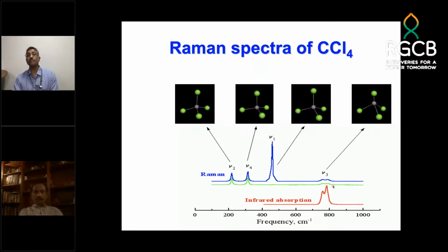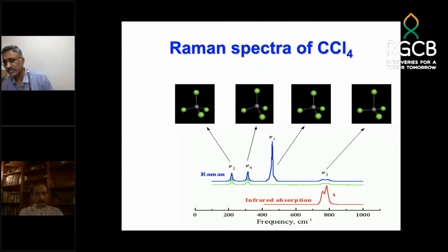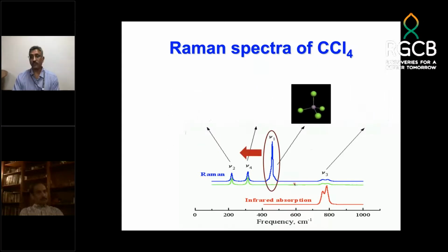In fact, many of you would have seen that Raman can even be used in a complicated molecule like DNA. So DNA fingerprinting can be done using Raman because of this reason, that they have very unique characteristics even when all the molecules look the same. That is why it is a fingerprinting technique for molecules also.